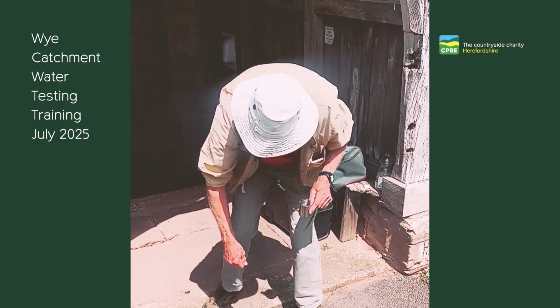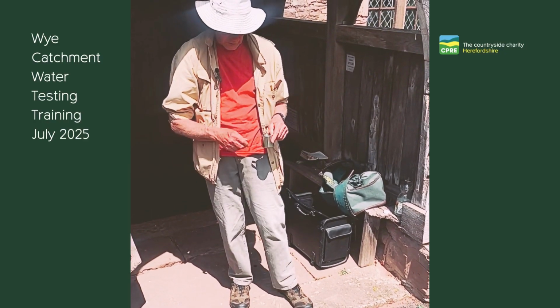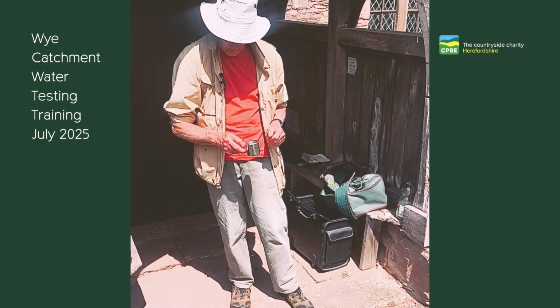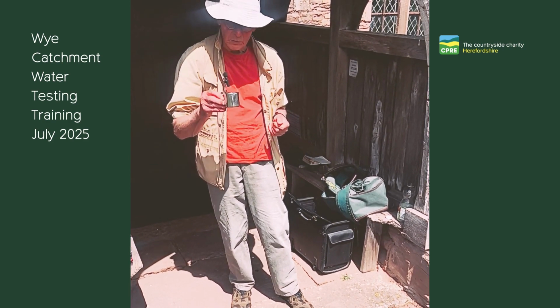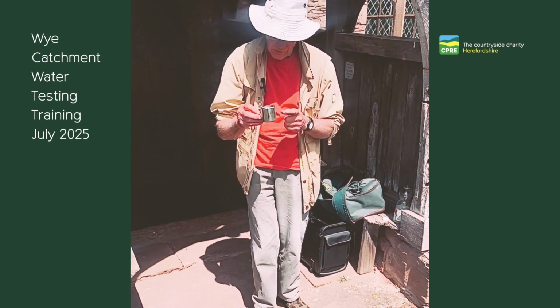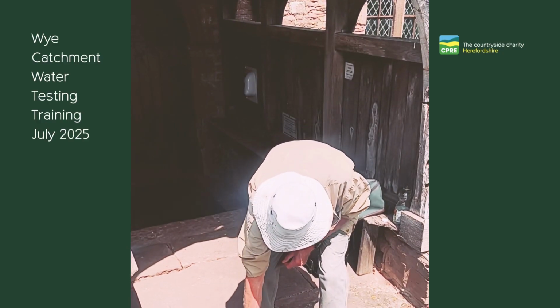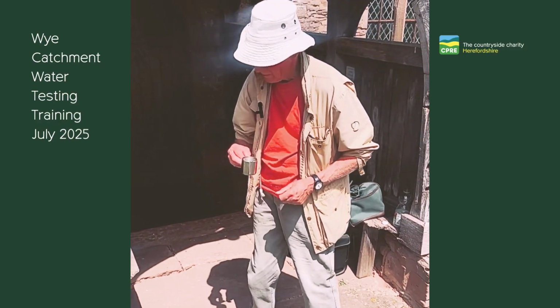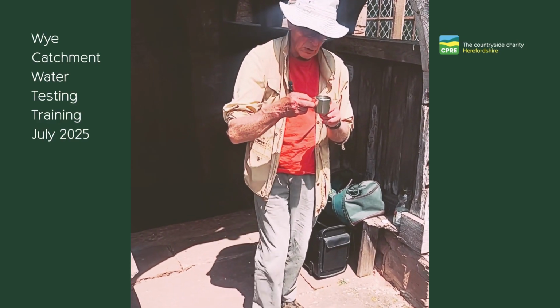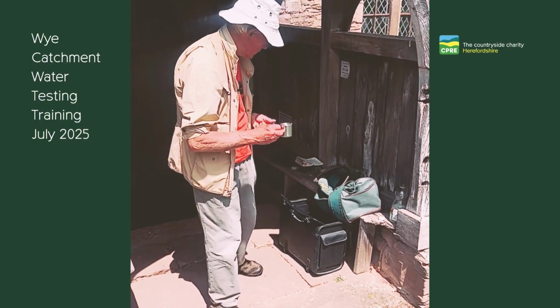If you're going to use a plastic jug like that, it's important not to leave the sample in it for too long, but as soon as you've taken it out of the stream, to put a smaller quantity, ideally in a stainless steel jug like this, to avoid any contamination that might arise from the plastic. So this is actually the part of the sample that we'll be using for testing.